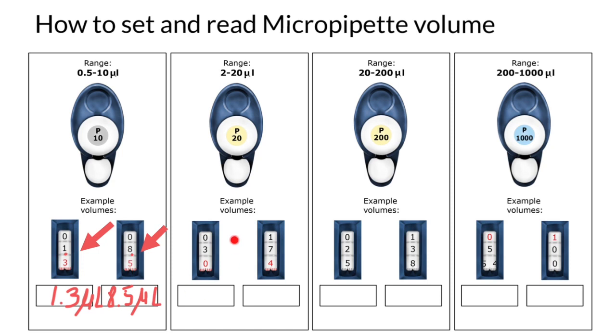Now let's check this reading. This is not 30 microliters, because the maximum volume that this micropipette can handle is 20 microliters. So again, imagine that we have a decimal point here, and this actually means 3.0 microliters.